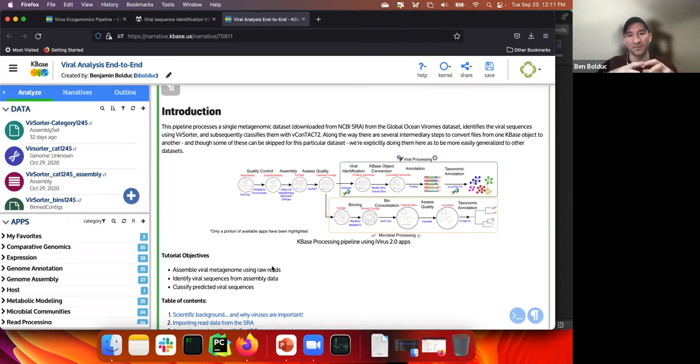KBase, on the other hand, has narrowed the focus dramatically and organized everything by what data you have, and you don't really have an option of how the data is stored. You can only upload data and download data. You don't have all the intermediate files available. Only if the developer is letting you download the data are you actually going to be able to download it.